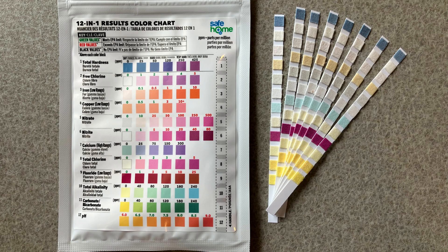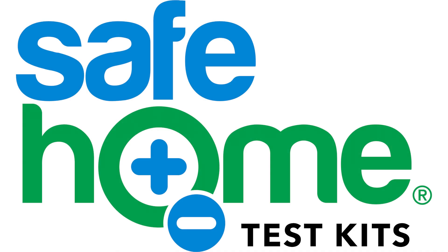Every pouch comes with multiple strips, so you can test multiple locations or test one location multiple times. If you have any questions, reach out and we'd be happy to help.